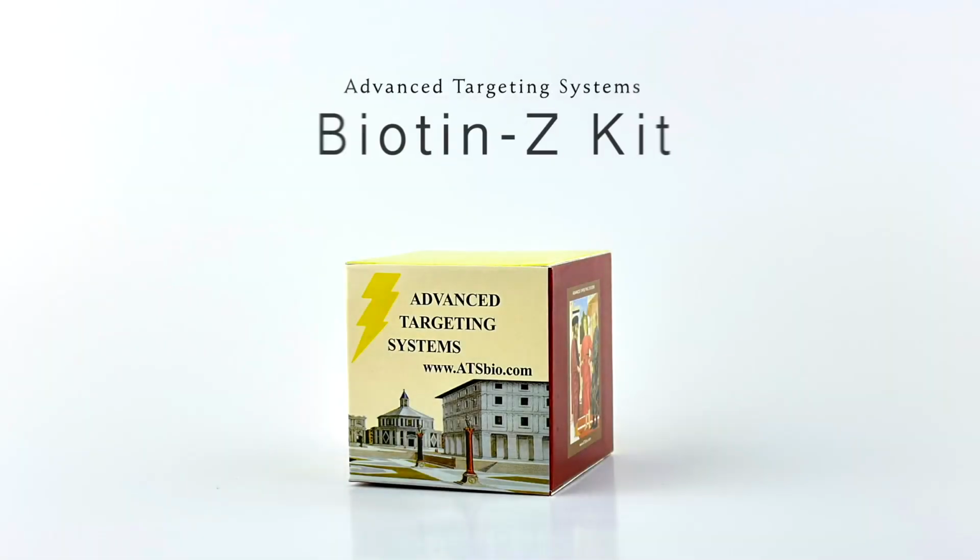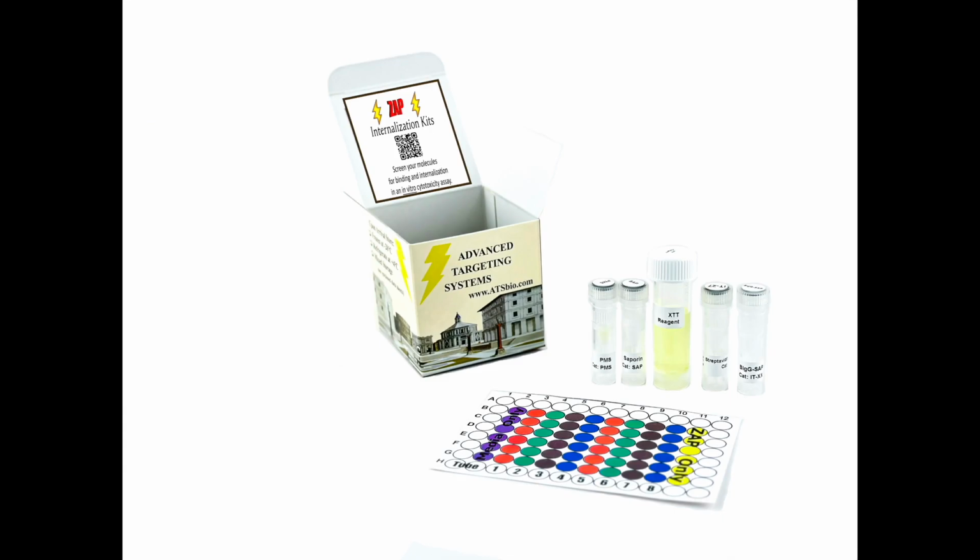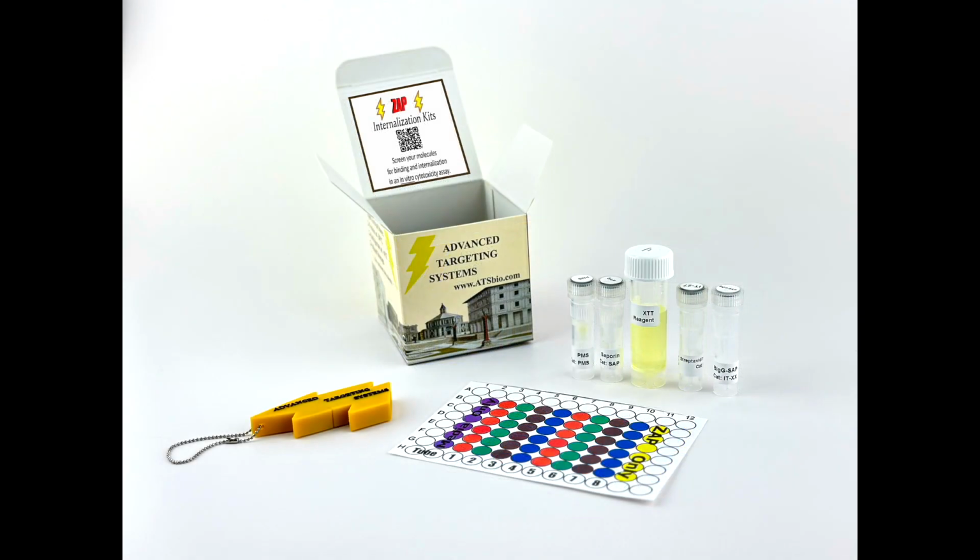In this portion of the video, we will be preparing the sample dilutions for the materials that you'll need to add to the plates. This will include the biotin-related molecule mixed with streptavidin-ZAP along with the controls. Let's get started.